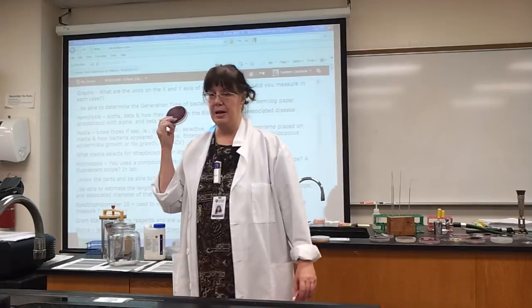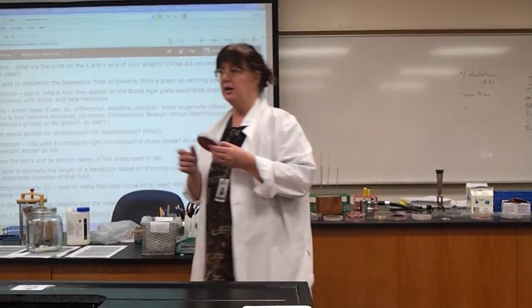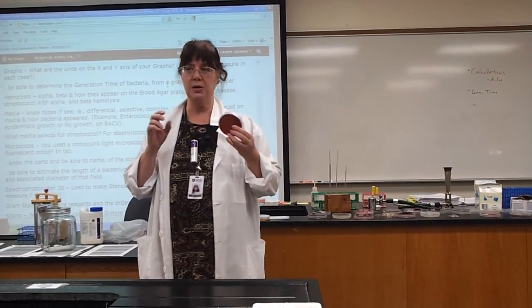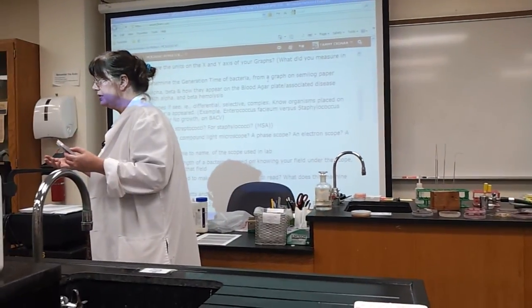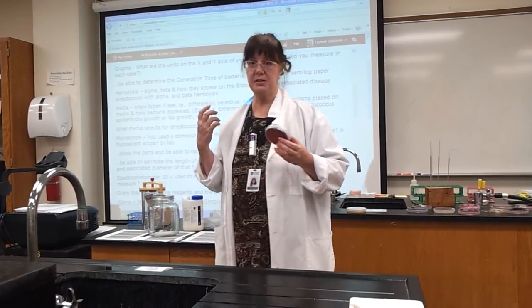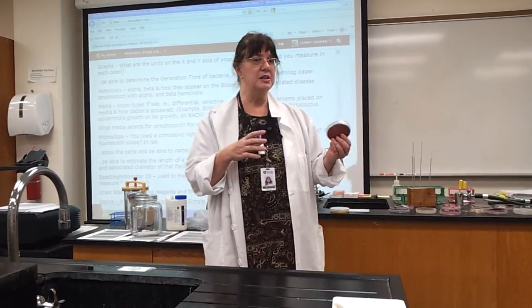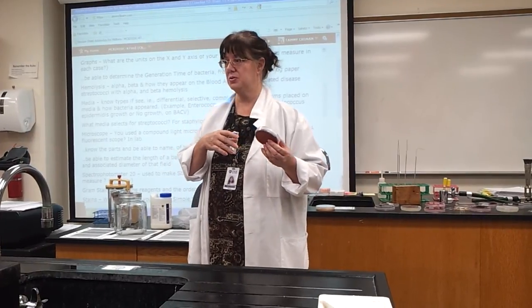Okay? Now, if your blood agar crystal violet came out of that candle jar and you have beautiful royal blue colonies, that's some sort of streptococcus species, because it picks up the what dye? It picks up the crystal violet. The crystal violet's what? Violet, blue, purple. All the other colonies, if they grew, still it wouldn't be staph, but it could be something else.